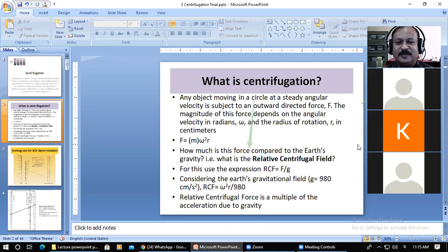Sir, I think they remain in thread-like structures. I couldn't hear you properly, Inamul. Yes, I think fungal cultures remain as thread-like structures. But will they settle down or will they remain floating? Sir, they will remain suspended in the liquid.